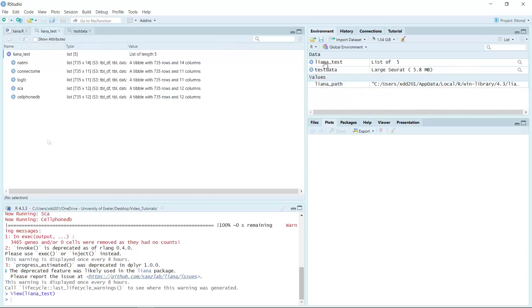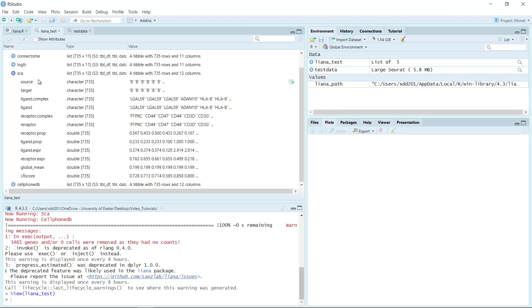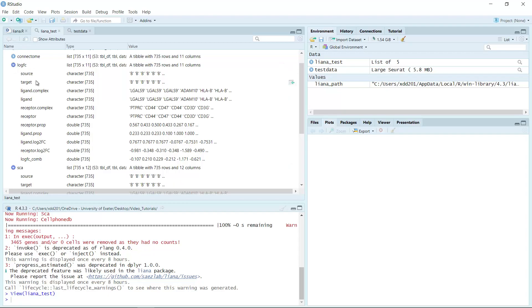If we click the test result, you can see we have the analysis for the NATMI method, Connectome method, logFC method, and CellPhoneDB. We have the same number of rows in each method but a different number of columns. Let's use the SCA result as an example. You can see we have the source, target, ligand, receptor, and for the SCA method, the ligand receptor score. For other methods it looks very similar — source, target, ligand, receptor — but the additional columns are method-specific results, for example ligand log2FC and logFC combo for the logFC method.